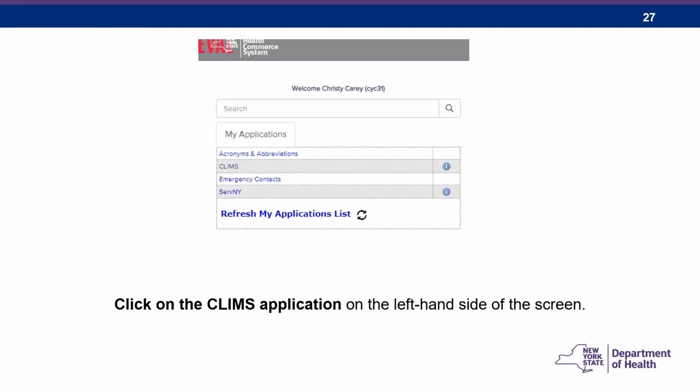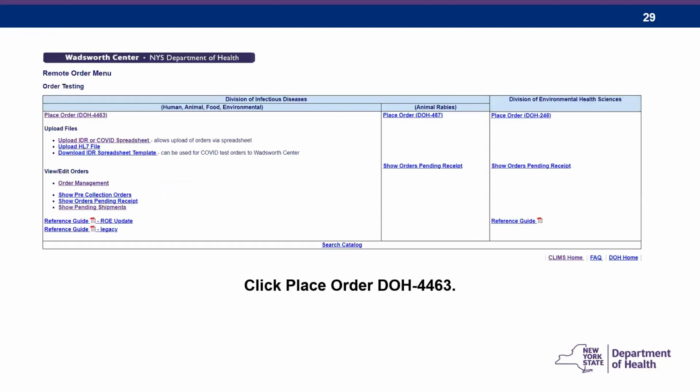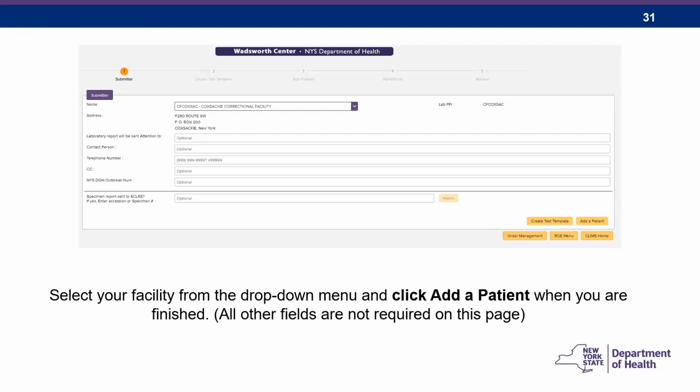Okay, so to begin, you'll log into HCS, and the first thing you'll do is click on the CLIMS application, which is on the left-hand side of the screen. Next, you'll click on Remote Order. Then, at the top left-hand screen, click Place Order DOH 4463. Click Submit Human Specimen. Then select your facility from the drop-down menu and click Add a Patient over here. All other fields on this page are not required.